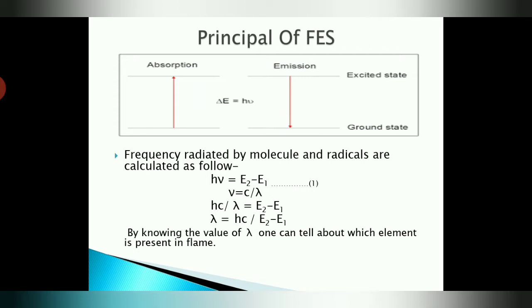How high? It should evaporate the liquid component of the sample entering the flame in the form of mist, or vaporize it, and convert the residual solid particles into the gaseous state as completely as possible. Finally, after mist formation and vaporization, the solid compound is completely converted into the gaseous state, and therefore the molecules dissociate and form free neutral atoms or radicals.